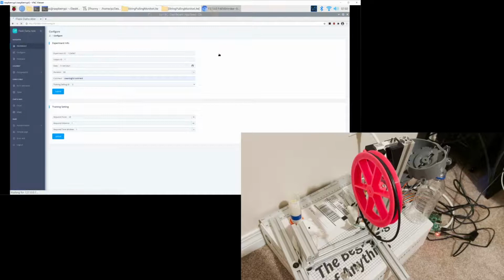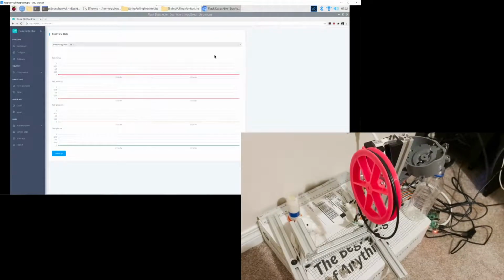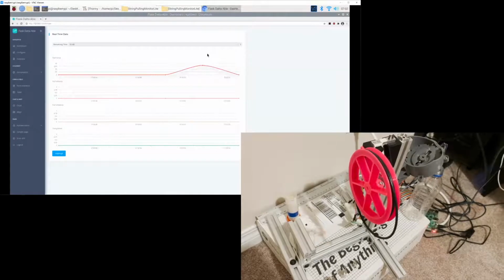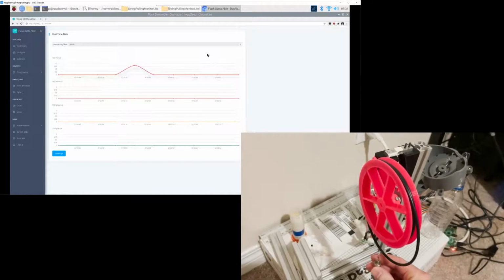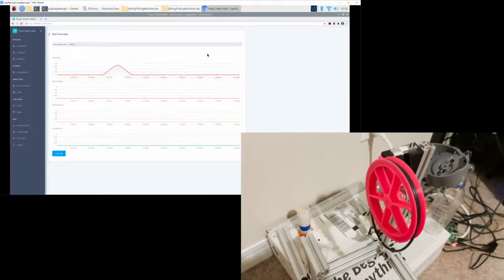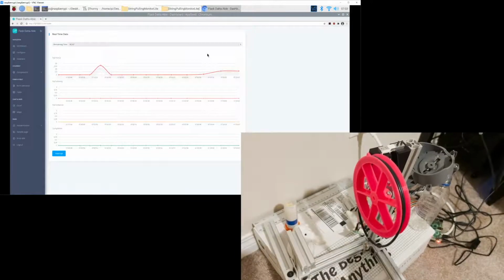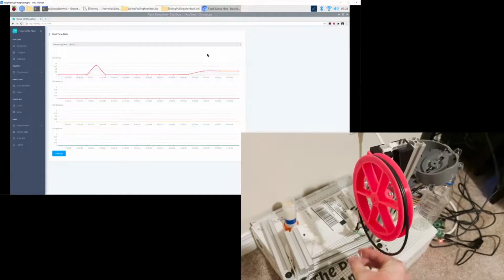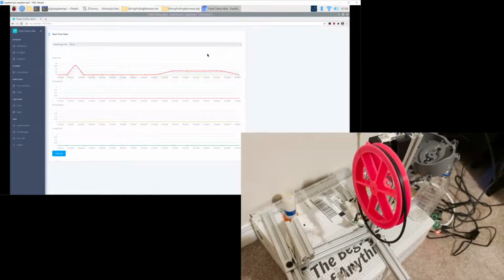So now we are starting the task. We can view all the data on the web server side. And now we are gonna start by putting a load of 10 grams. The device will soon detect the load and send the data to the server. Also, since the load hasn't reached the target of 20 grams, the pulley won't move.